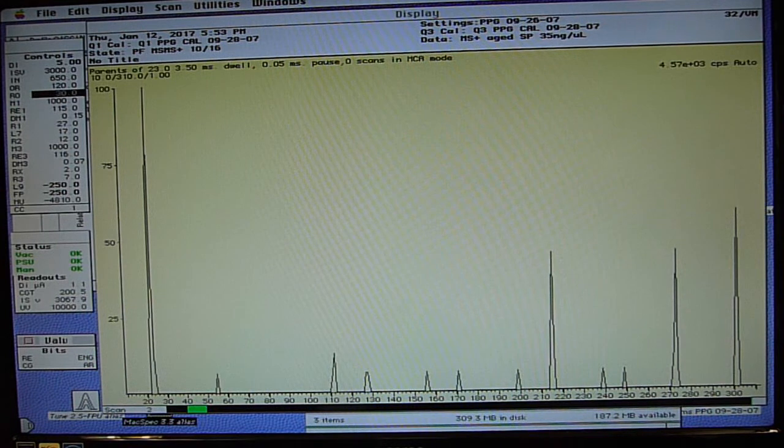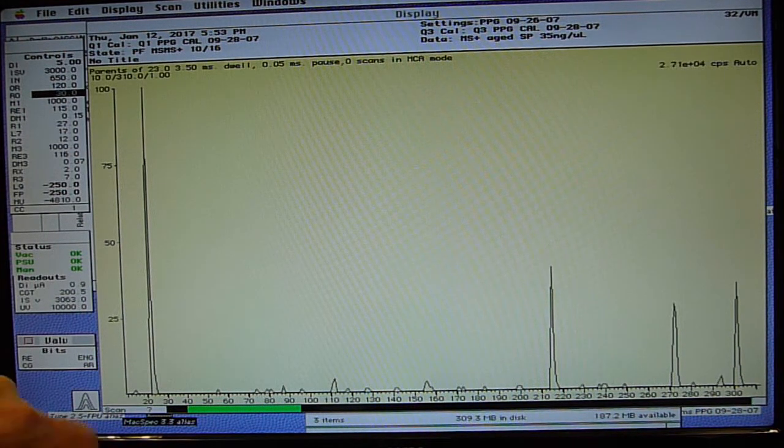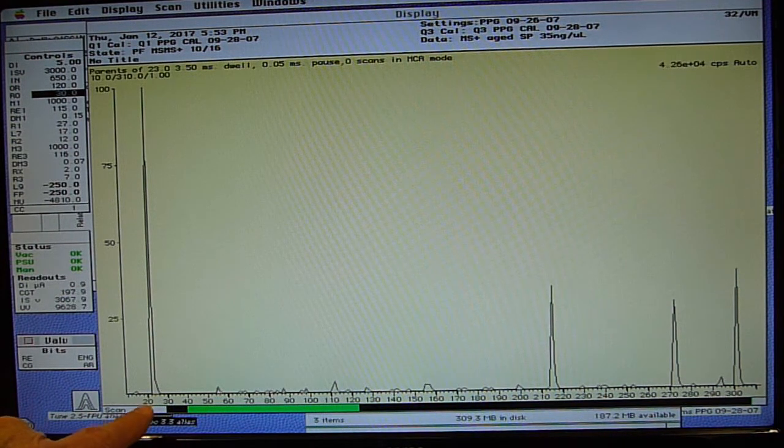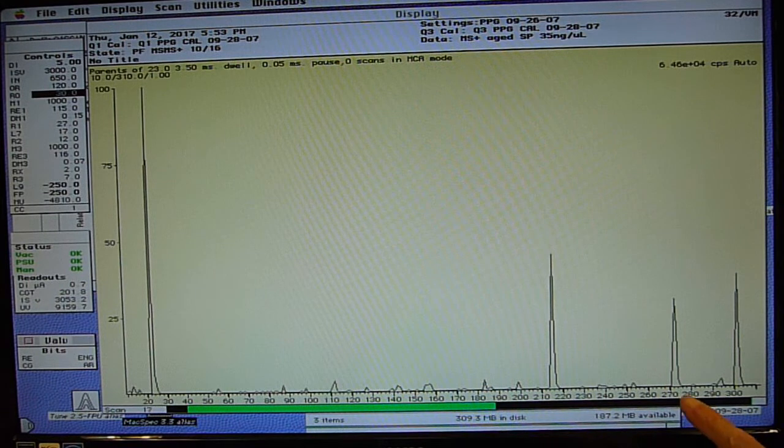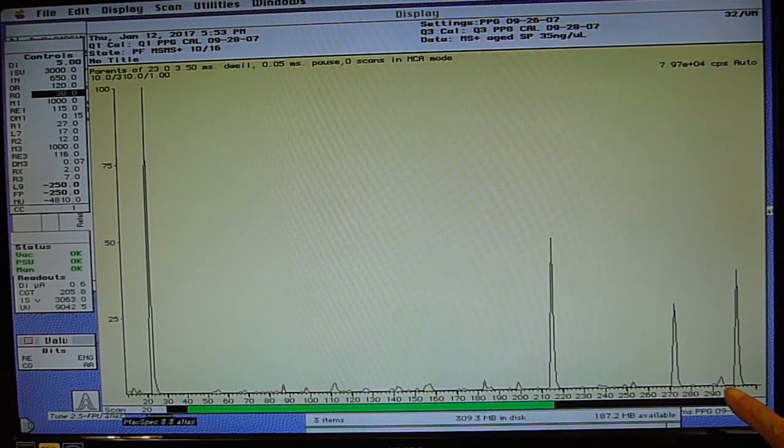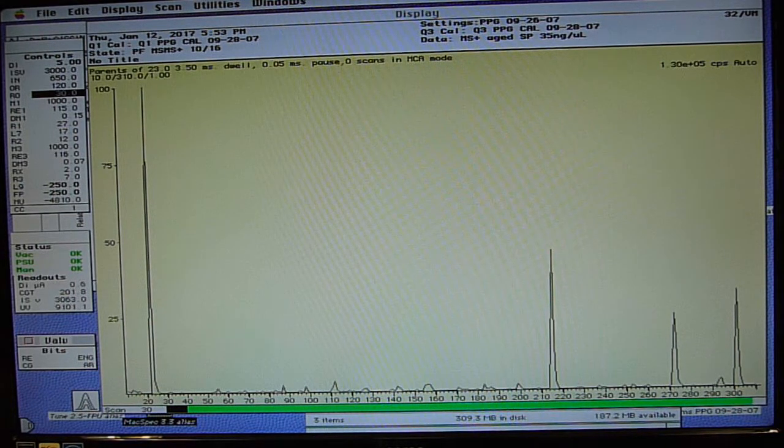So if Q3 is sitting at 23, and we have 23 in the mix up there. It's nice to see that. And then we have, oh look, that 215. That 272. There's a little bit of a 294. Which is from there. And then we have this 308. So these are the ions that have sodium as part of their composition. And this is at a collision energy of 15 eV.